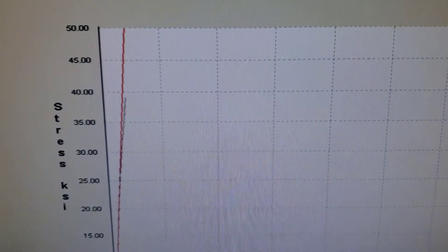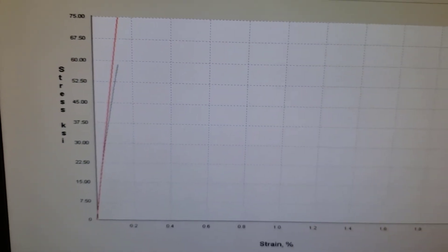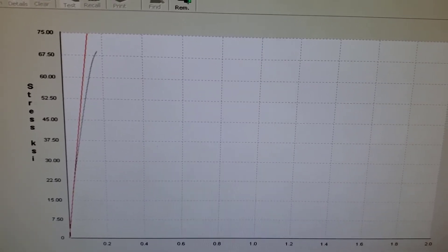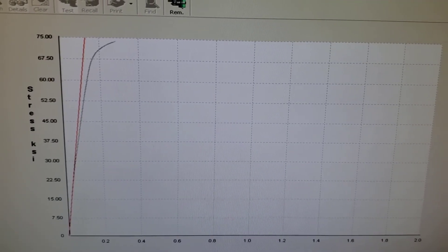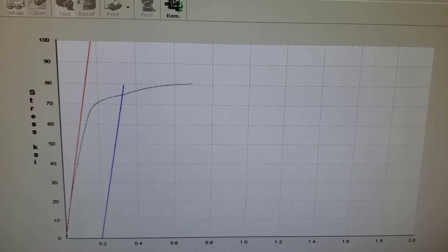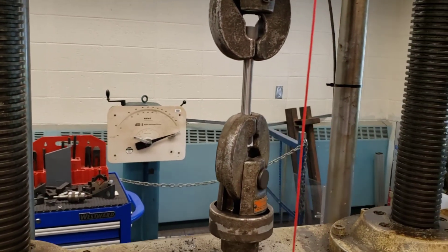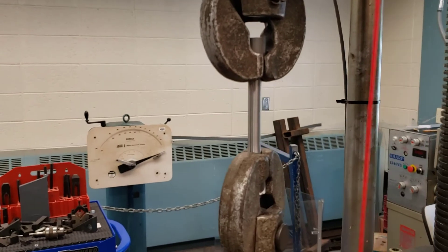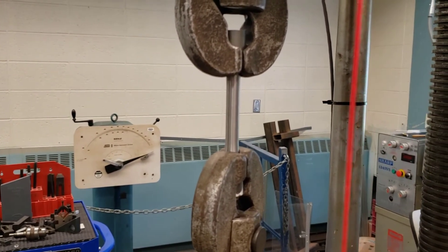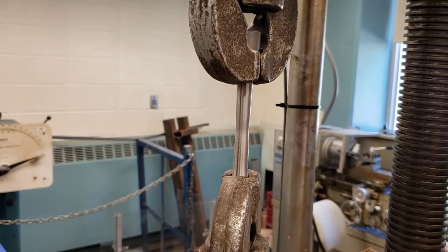We're measuring load versus deflection; the computer converts that to stress and strain using the cross-sectional area and the 2-inch test gauge. The axes on the graph automatically adjust — it was at 50, now at 75. The curve is starting to fall over: we've yielded the steel. That blue line indicates yield and now we're going plastic. We can now remove the extensiometer — we must do this before the test finishes. This test only pulls off the linear portion and the first 1% of plasticity. Speeding up, you'll see the specimen starts to neck at the end — it gets very narrow.